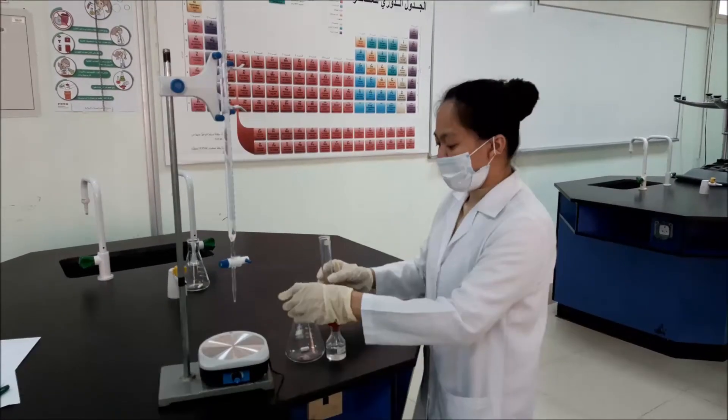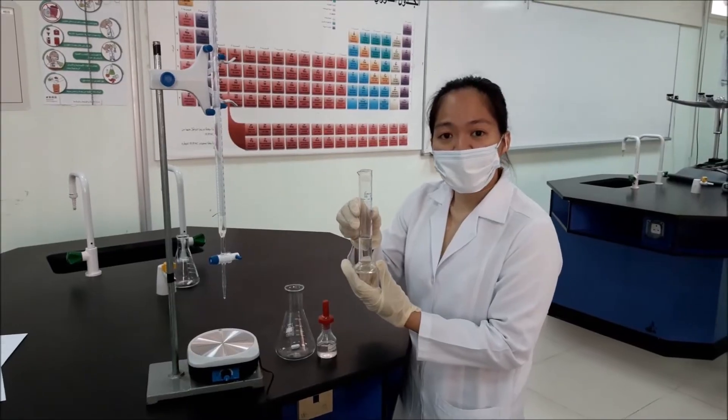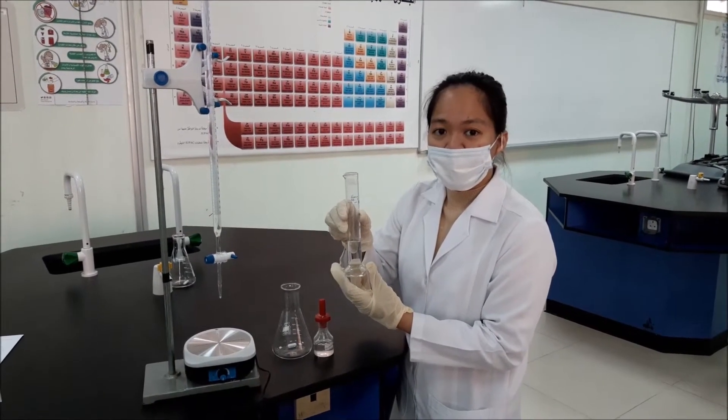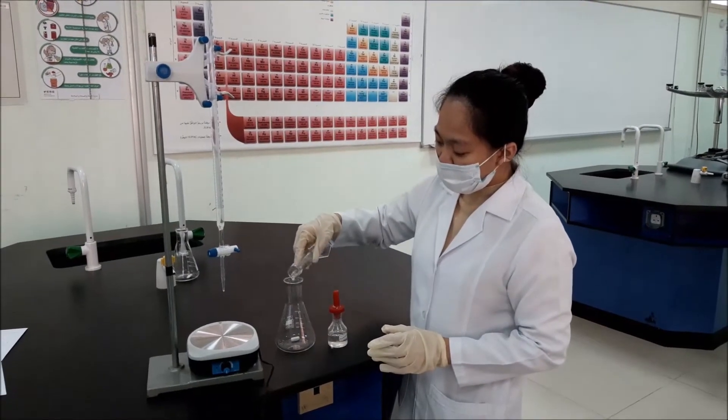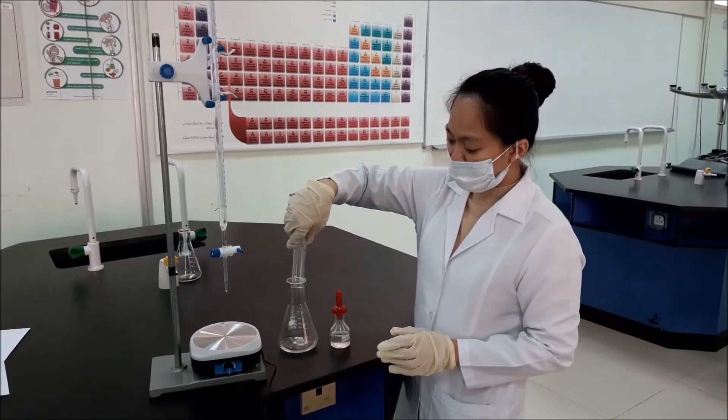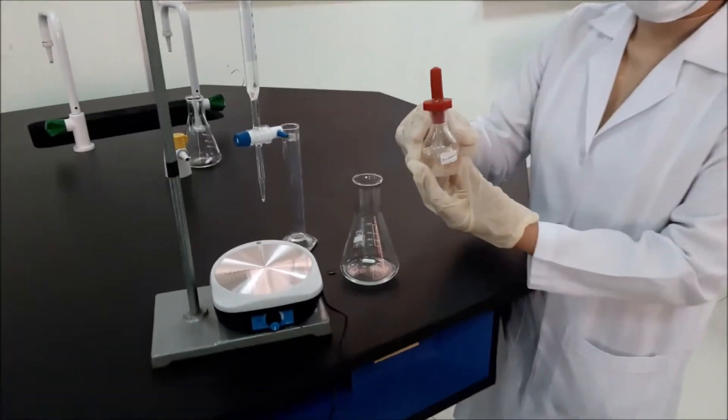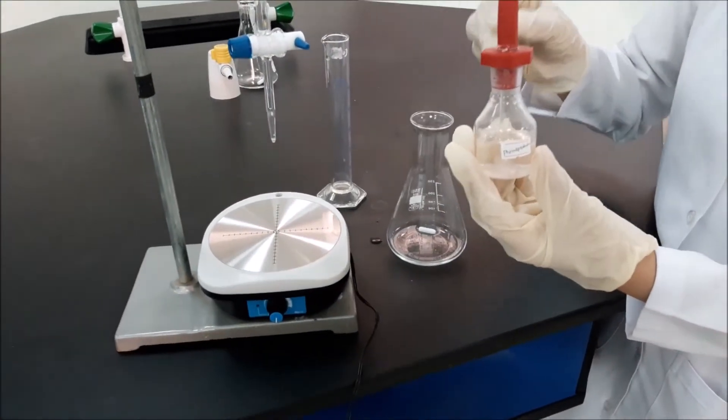And now, I measured 20 ml of acetic acid with unknown concentration. I will put it in the flask and put 3 drops of phenolphthalein.